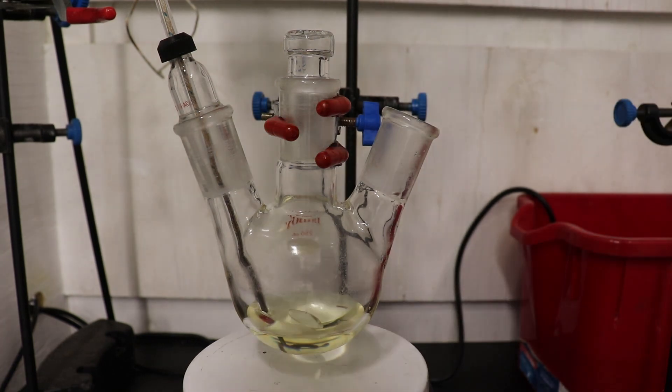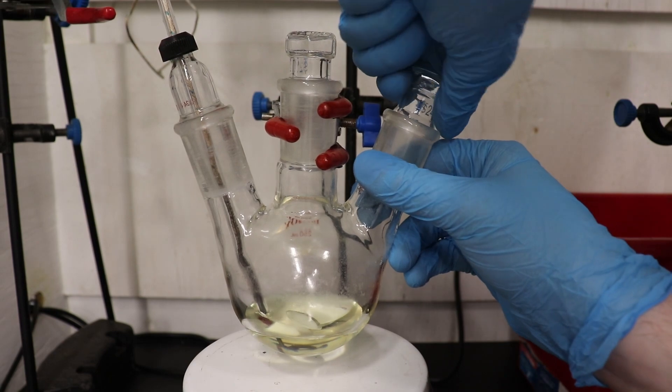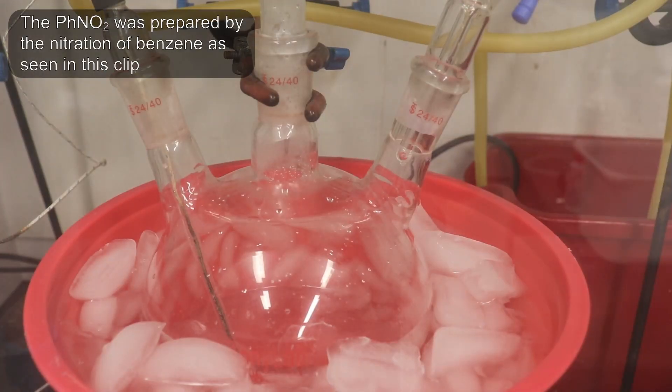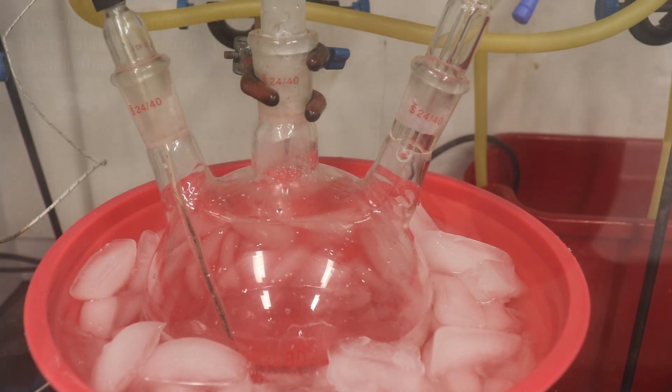Nitrobenzene is a pretty common solvent to use in Friedel-Crafts reactions, as the nitro group is strongly electron-withdrawing, which deactivates the aromatic ring, preventing it from acting as a nucleophile towards carbocations and acylium ions, while also being able to dissolve aluminum trichloride and whatever substrate you're working with.